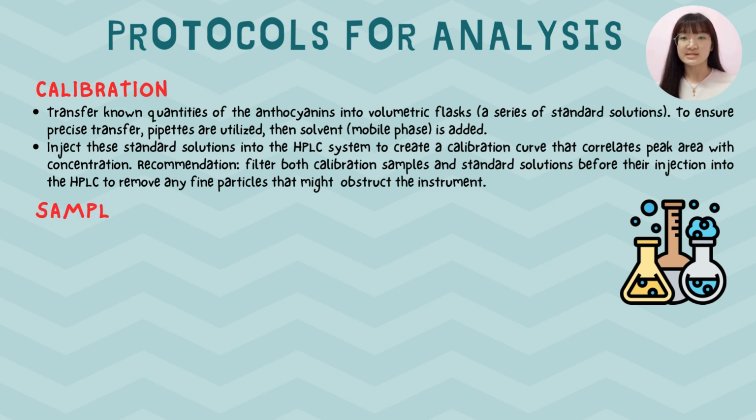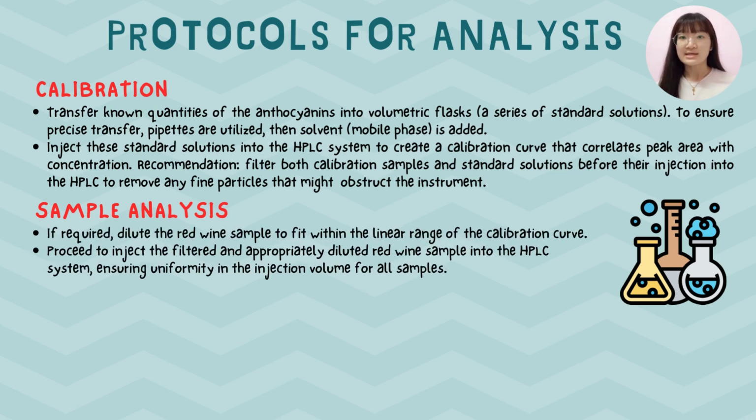The next protocol is sample analysis. If required, dilute the red wine sample to fit within the linear range of the calibration curve. Then, proceed to inject the filtered and appropriately diluted red wine sample into the HPLC system, ensuring uniformity in the injection volume for all samples.